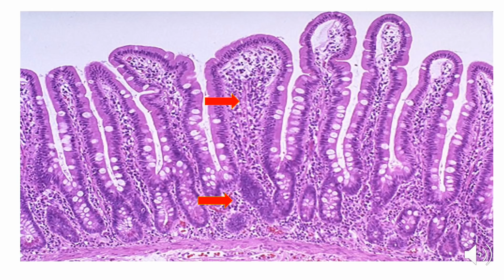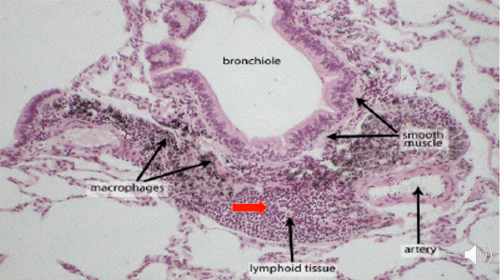These finger-like projections are the villi of the small intestine. Please take a look at the simple columnar epithelium of the small intestine. And below the simple columnar epithelium, you have an accumulation of lymphocytes. And these lymphocytes are arranged in diffuse pattern. Take a look at the lymphocytes found below the epithelium of this bronchiole. They are arranged in diffuse pattern.